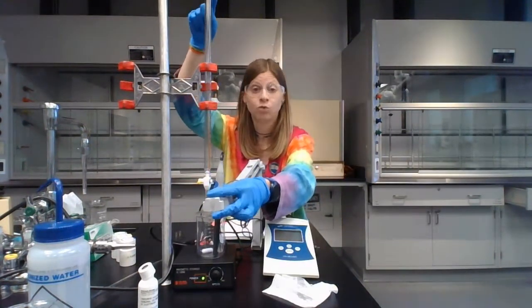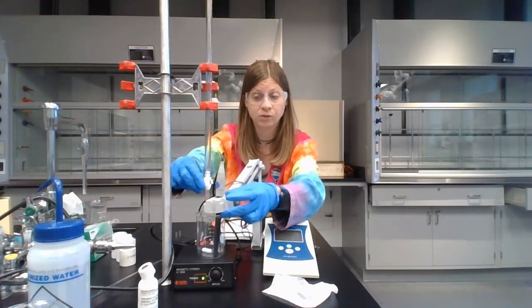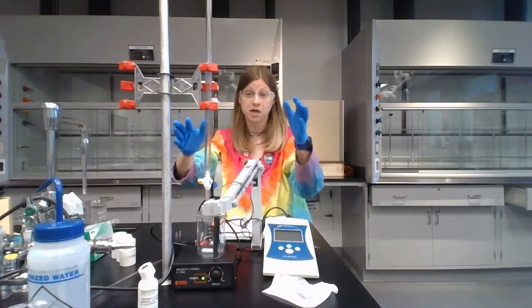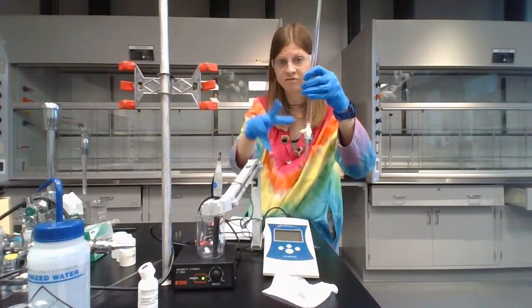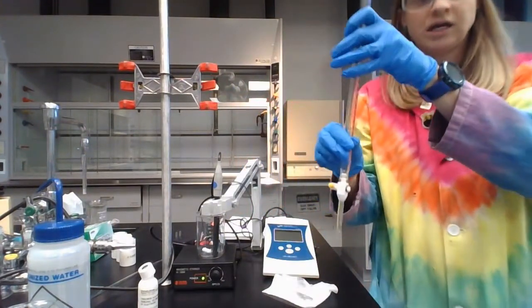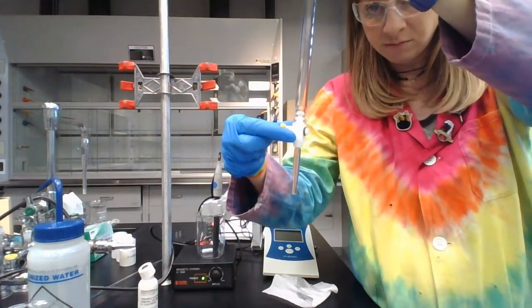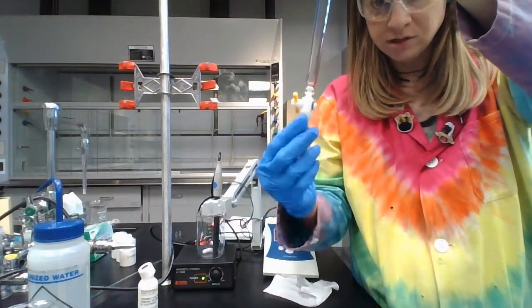Now next, you're going to very carefully release sodium hydroxide from the burette until it's at the 1.00 mark. So you'll use the stopcock, the valve, to open the liquid and then to release it. When you're using a burette and you need to add a slow amount, people typically do a sideways thing that lets it come out drip, drip, drip.